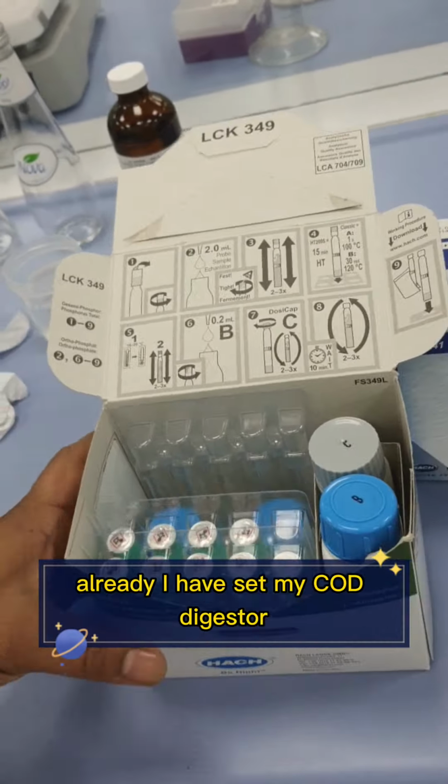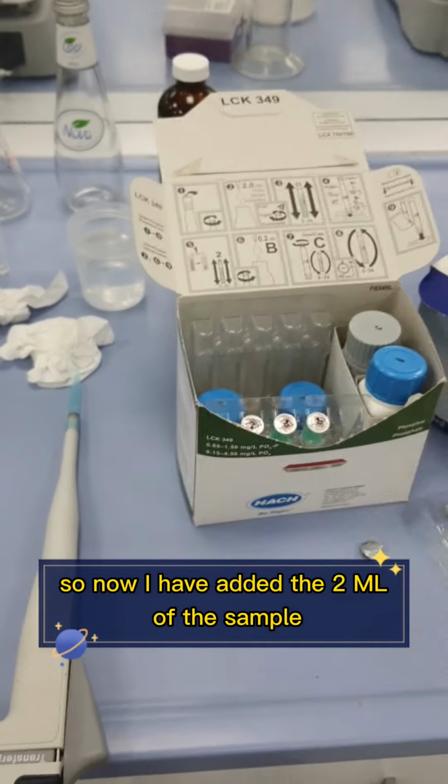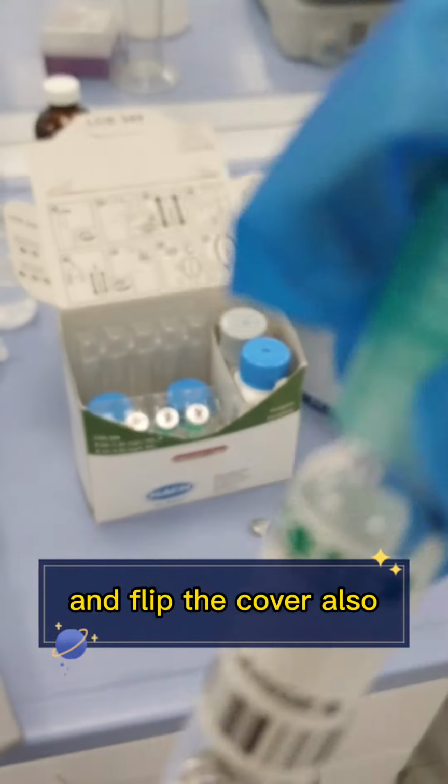Already I have set my COD digester. I will just be showing you. So now I'm going to add 2 ml of the sample as per the instructions. So now I have added the 2 ml of the sample and flipped the cover also.